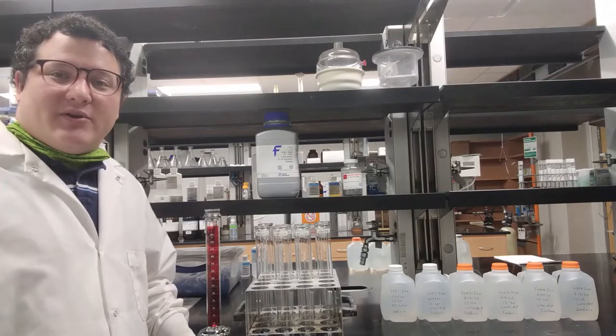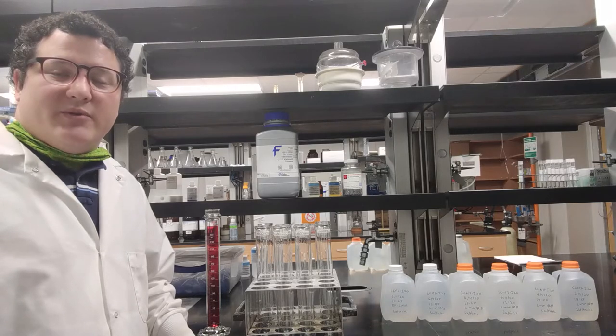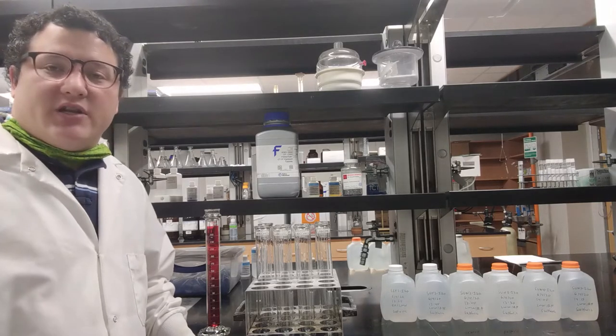Hi, this is Darren with the Mississippi State Chemical Laboratory, and today we're going to be doing our Kjeldahl total nitrogen analysis.